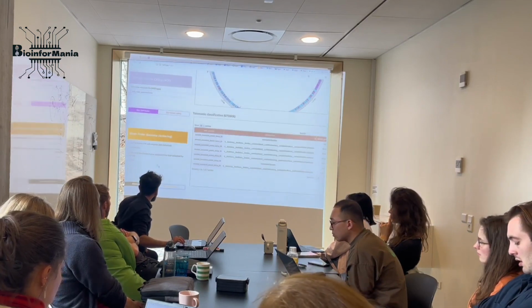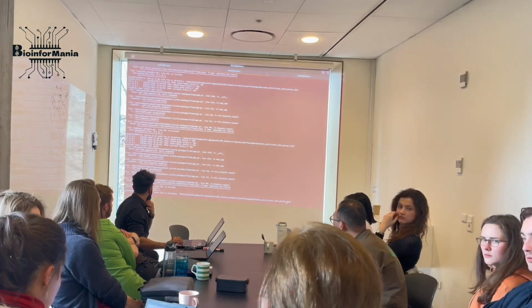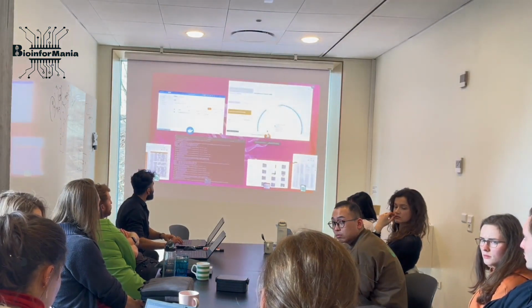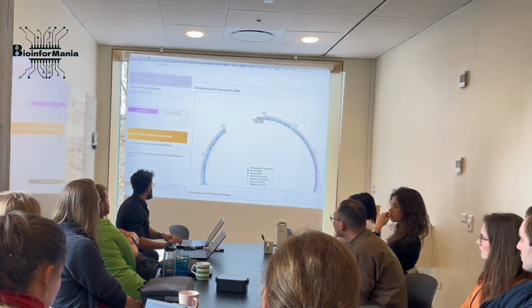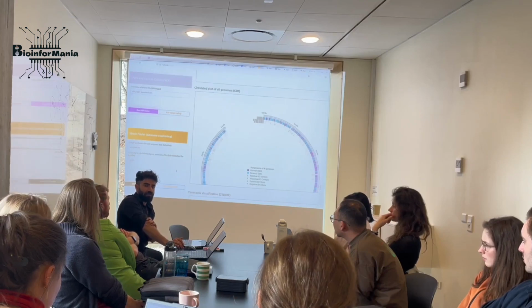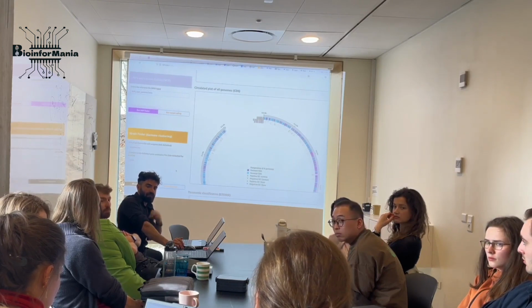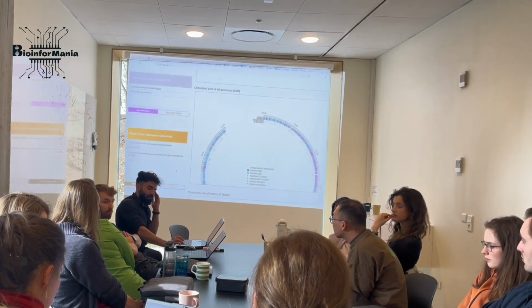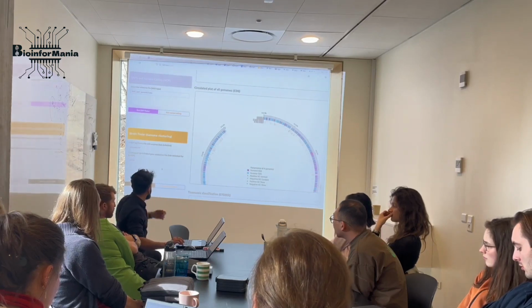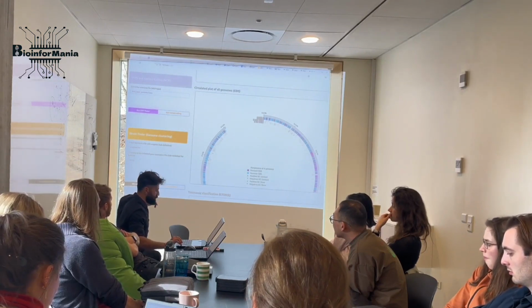Sorry, is it possible to use it for the human genome or only for prokaryotes? Well, this one, obviously you can assemble human genomes with it and annotate, definitely. I'm wondering, is it possible? It's definitely possible. Yeah, all the tools in it. I have seen studies that have used these tools for human genes, especially single nucleotide polymorphisms.